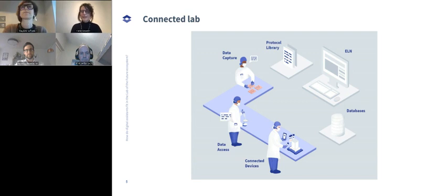Yeah, so interesting, and it's good that you mentioned things like temperature and humidity, because we have Sridhar with us also, who is helping the digital transformation of labs with IoT sensors, collecting data continuously from lab equipment or the environment. And so, Sridhar, how would you see the interactions with the digital lab assistant, or do you have any example in mind that you could share?